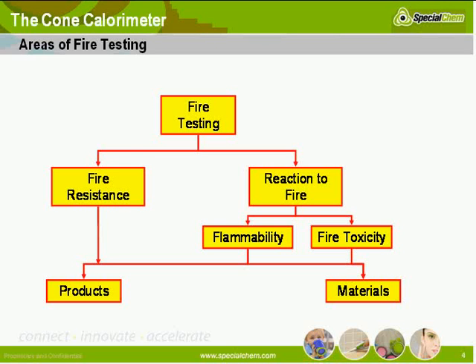But we're looking at whether they have the structural integrity during a fire, so whether they're softening and weakening, as well as their reaction to fire, which is essentially looking at issues such as their flammability or the toxicity of the fire gases. And both of those can be applied to anything in a continuum, really, between materials and products.